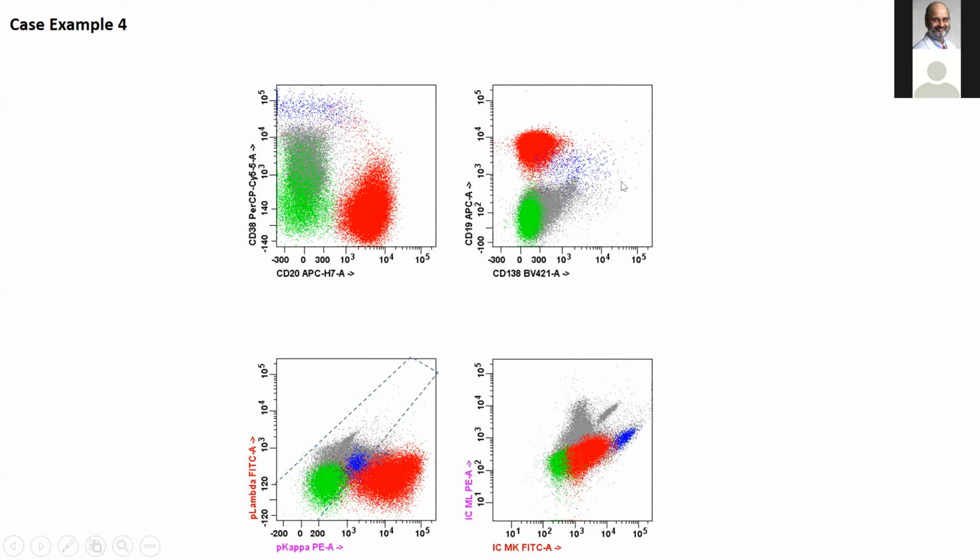But within the hematolymphoid world, it's really just plasma cells and a subset of immature B cells that show expression of CD38. So based on the fact that we've got really bright expression of CD38 and positive expression of CD138, these ought to be plasma cells, really.